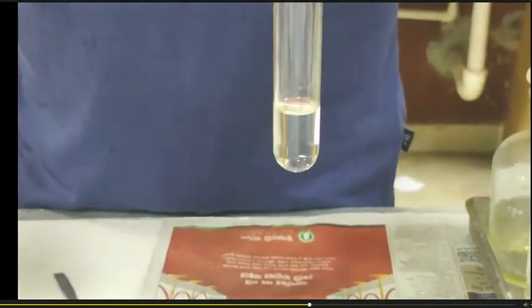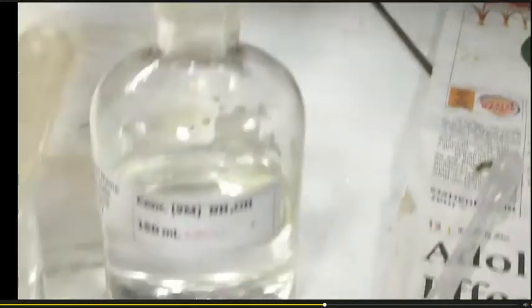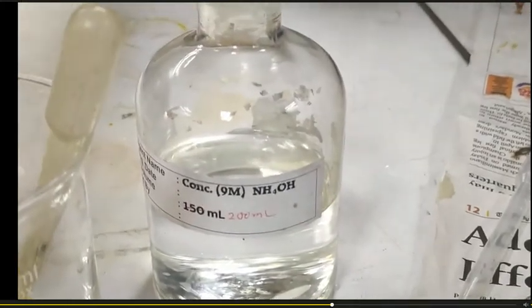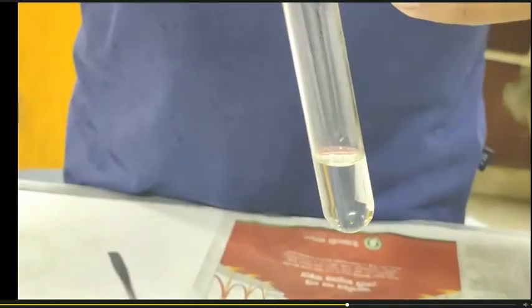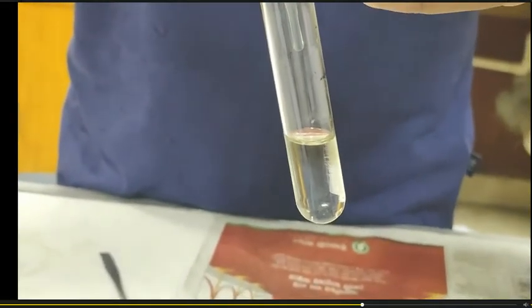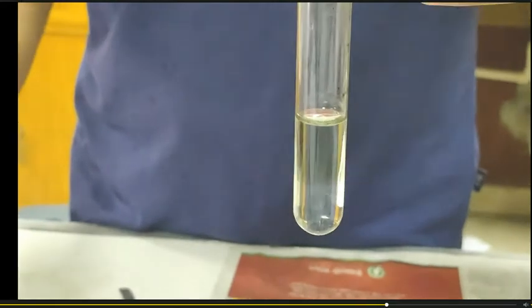Now into this test tube, we are going to add 9 molar ammonium hydroxide, concentrated ammonium hydroxide solution. If PPT appears, then it would be indicative of the presence of group 3 cations. There is no PPT, so group 3 cation is absent from this sample solution.